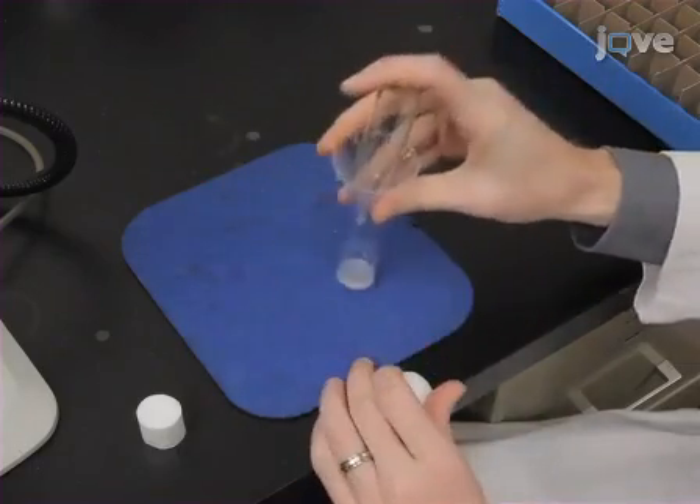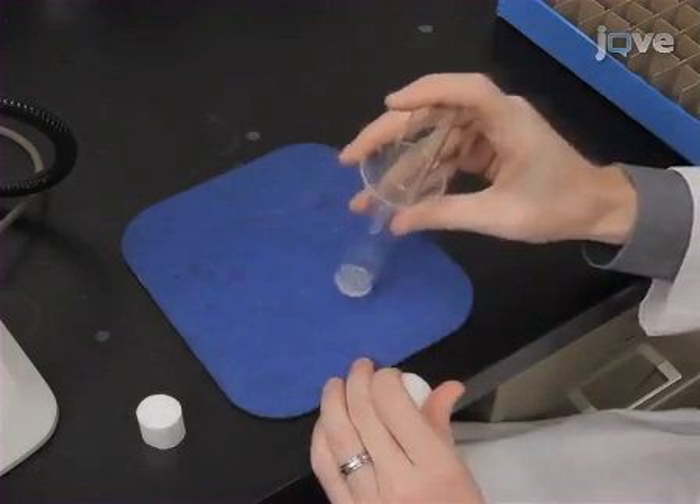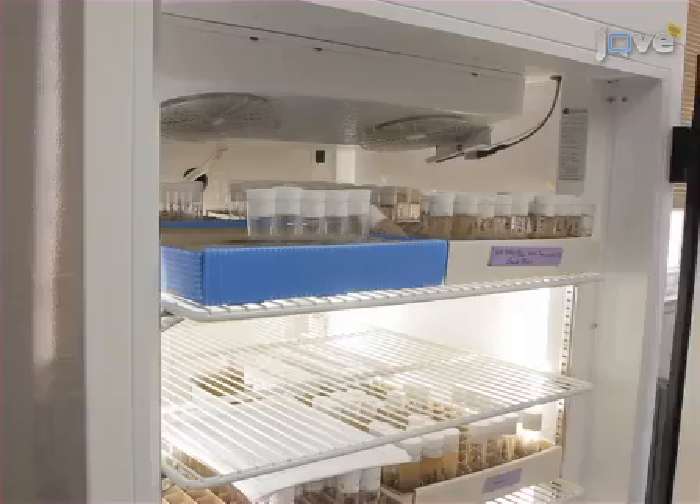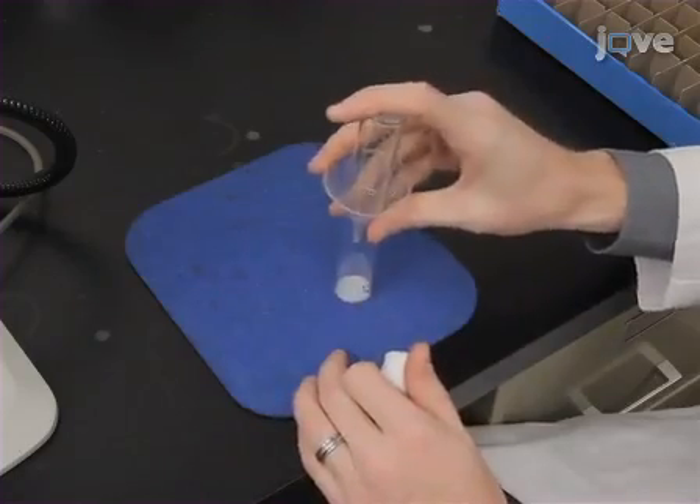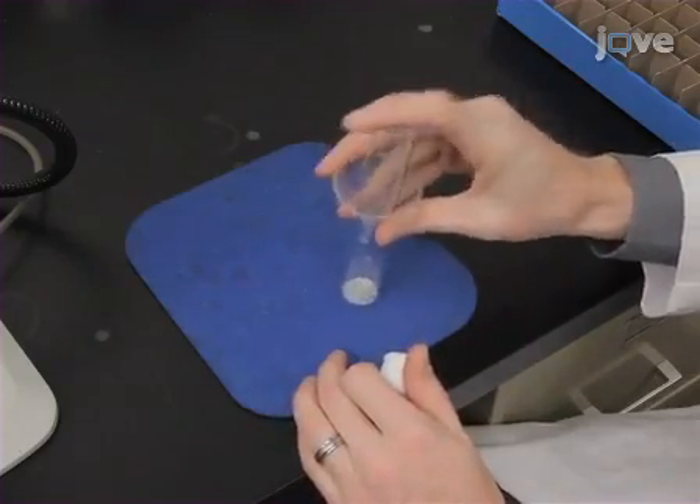After 10 days, transfer the flies to vials containing a 5 ml plug of 2% agarose and starve them for 12 to 16 hours. Then transfer the starved flies to vials containing 10% glucose-soaked filter paper for 1 hour prior to insulin injection.